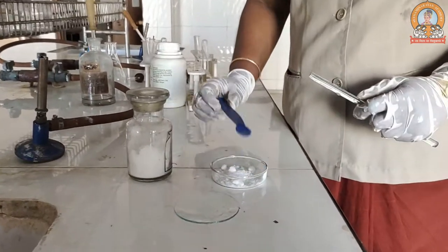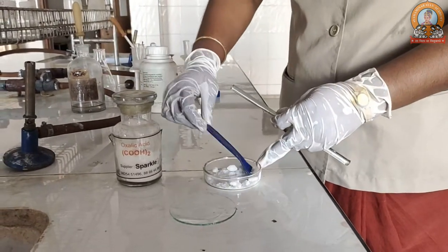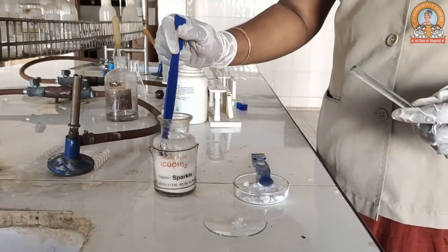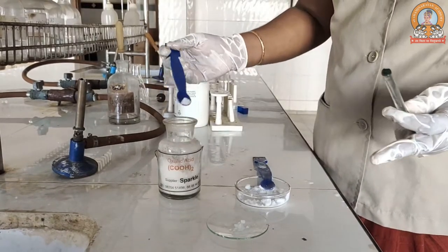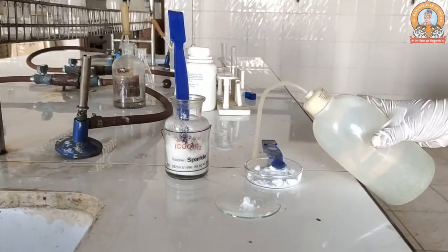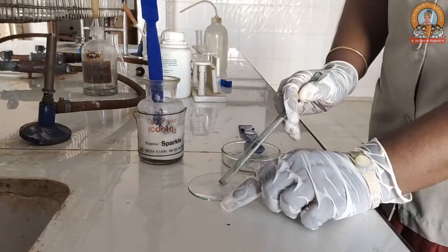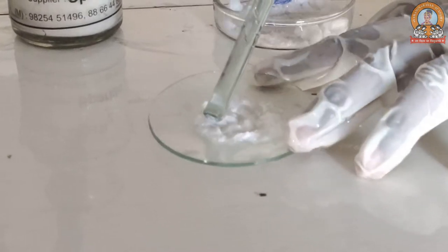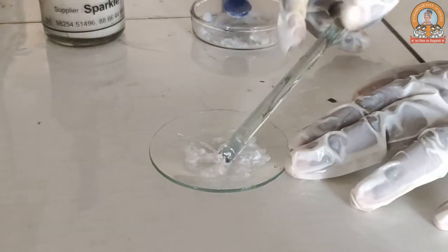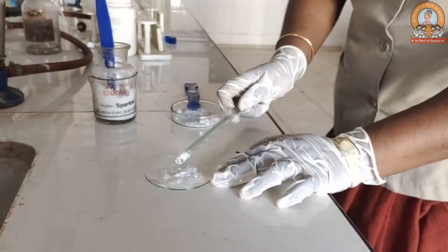We are moving towards the confirmatory test of the acetate ion. The first is the oxalic acid test. We will take a slight amount of salt, then the same amount of oxalic acid, and add a drop of distilled water, then make a paste with the help of a glass rod. Dipping the glass rod in the paste, just have a smell of it — it is having a strong smell of vinegar, which shows the presence of an acetate ion.